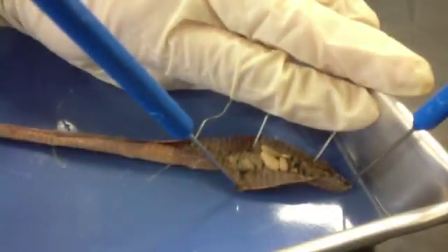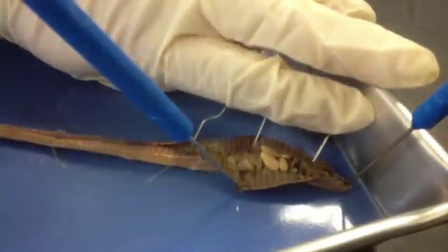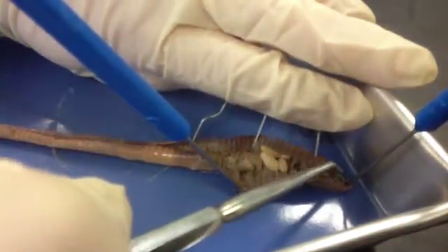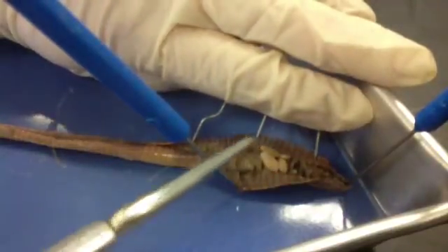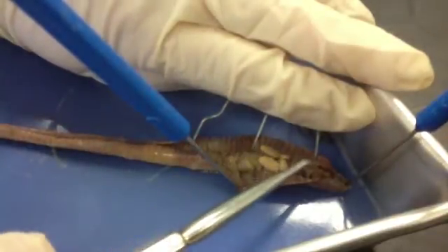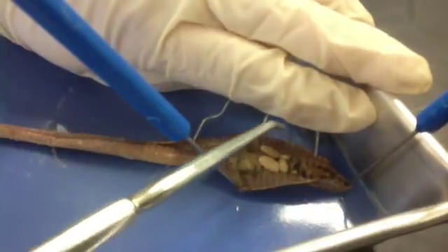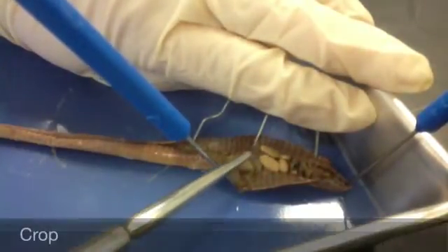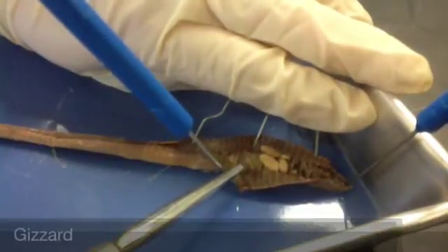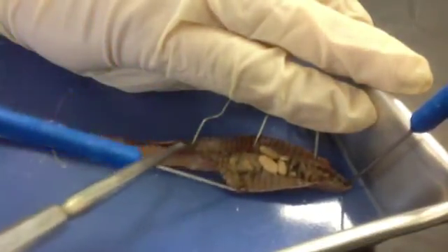I've opened up my earthworm. Some of these structures may be a little difficult to see on film, which is why you should do it for yourself in class. Up here we will have our mouth and our brain, which connects down the nerve cord — you can't see that right now. But let's talk about the digestive system: over here we have our esophagus, then going down to the squishy piece right here which is the crop, and the next is our gizzard. Behind the gizzard we have the beginnings of a really long intestine.